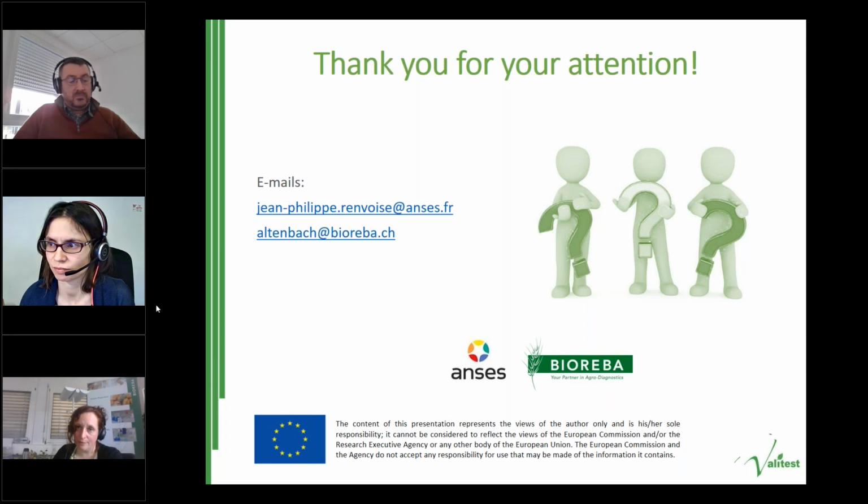I know that I don't want to give precedence to one trademark over another, but for sure Optigen has some tests available for insects. And there are also on-site tests for nematodes, if I'm not mistaken.